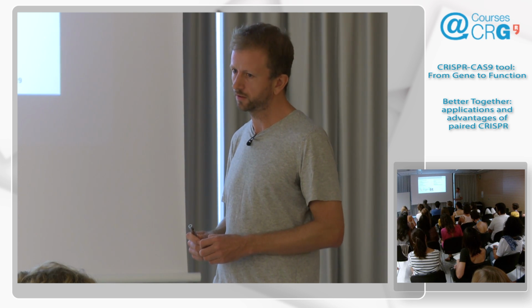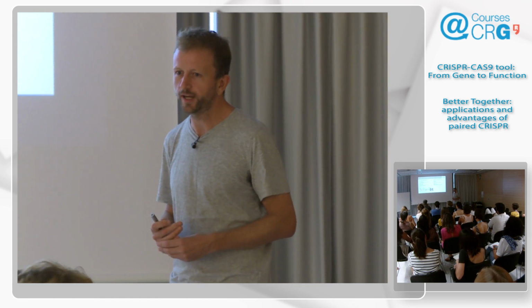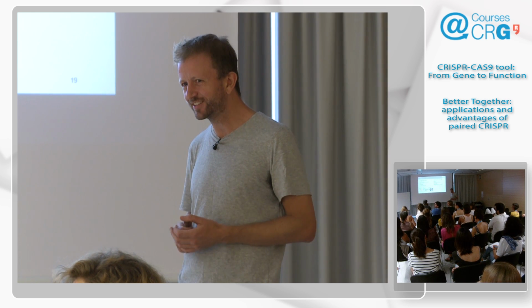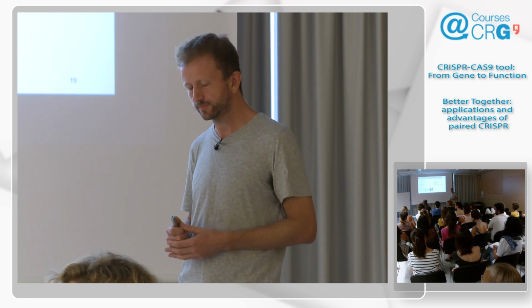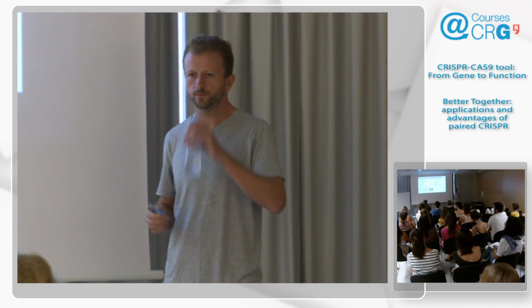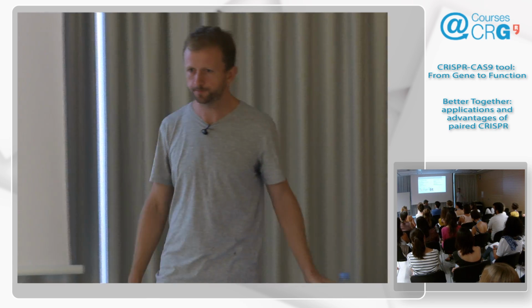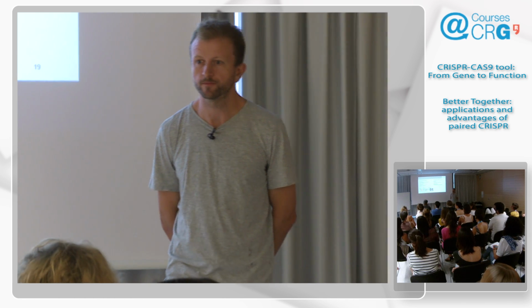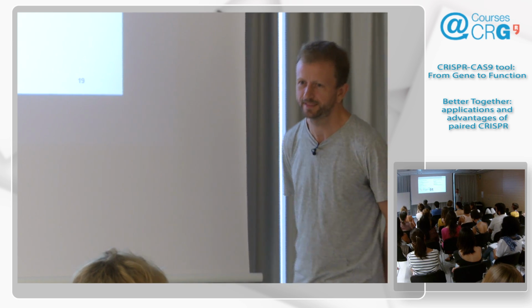Out of this 96 well plate where you have sorted your cells, how many clones would there be? Well, Estelle, who did the experiment, is right behind you, and I would say 2%. It depends also on what you are targeting, so it will depend on your guide RNA. At the end it was between 2 to 5%, and this is what people are seeing for complete deletion. Should we expect half of the plate? No, and also because not all wells will grow cells. So it's low efficiency, but it works.